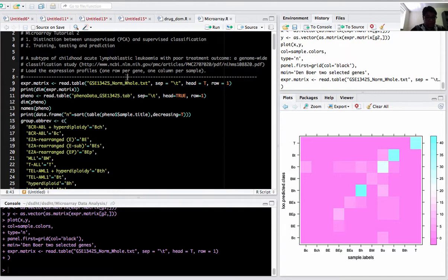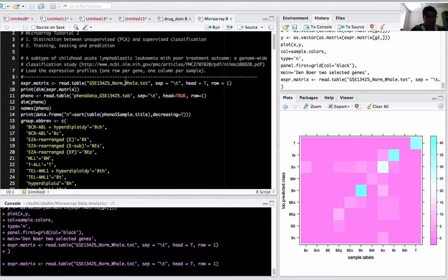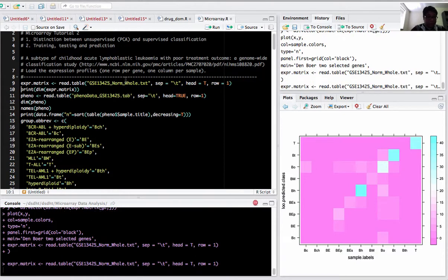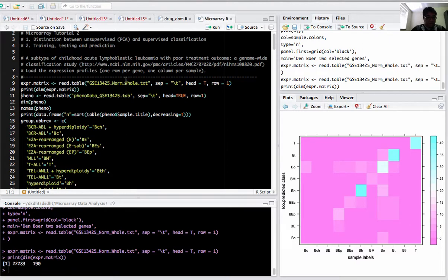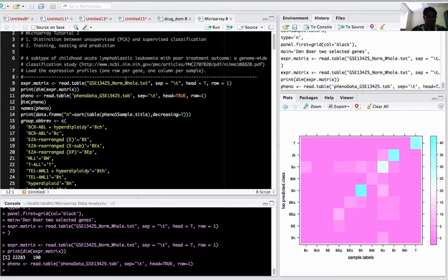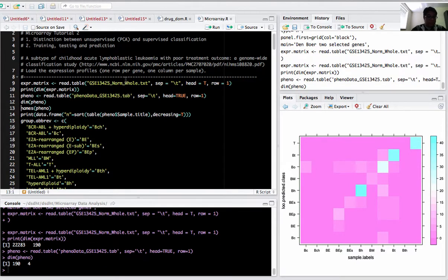I loaded the expression matrix first. It consists of 22,283 genes and 190 samples from patients. I read the pheno data - it consists of 190 samples and four different titles.